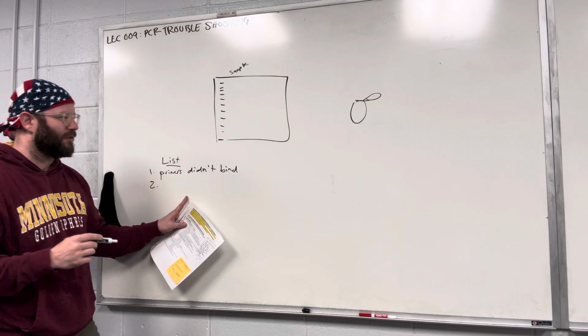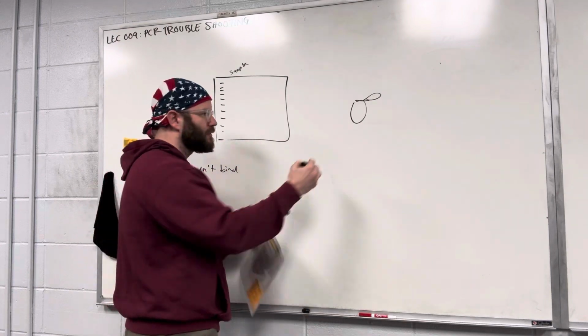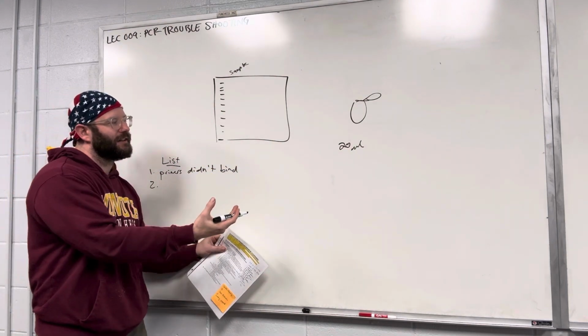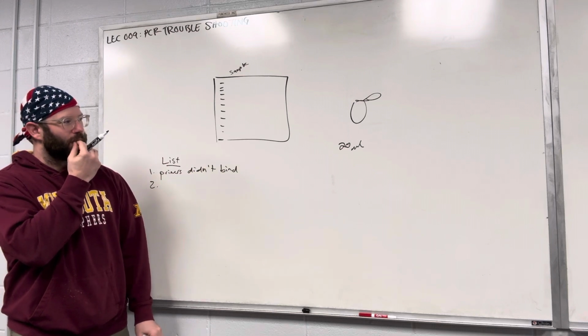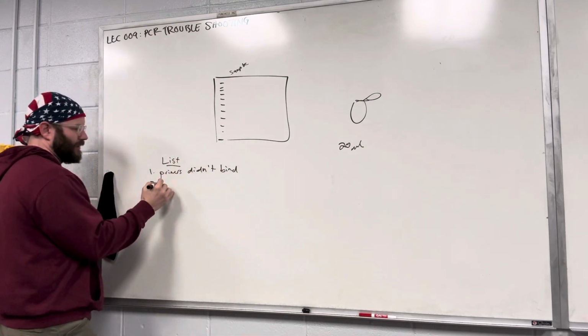Okay, let's explore that though. You're right that usually PCRs have a sample volume, usually like 20 microliters. But when you say too little, what is not in there, what would be not enough? Template? That can go wrong. You could have too little template.